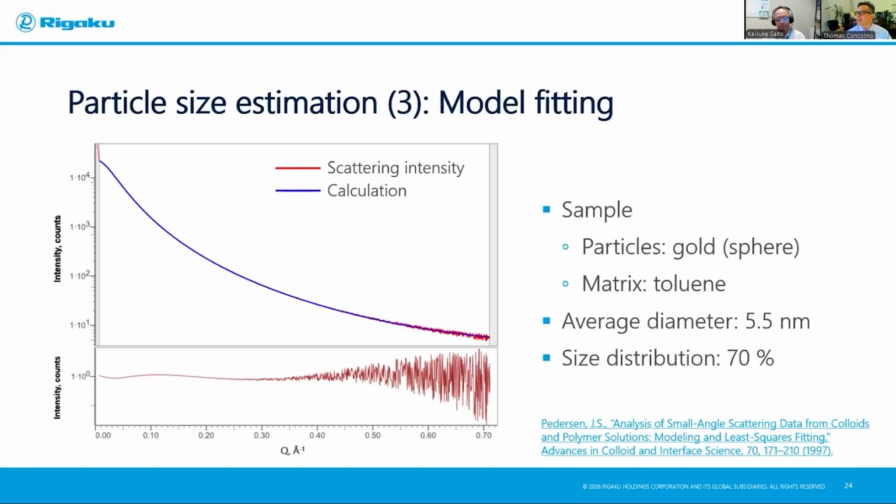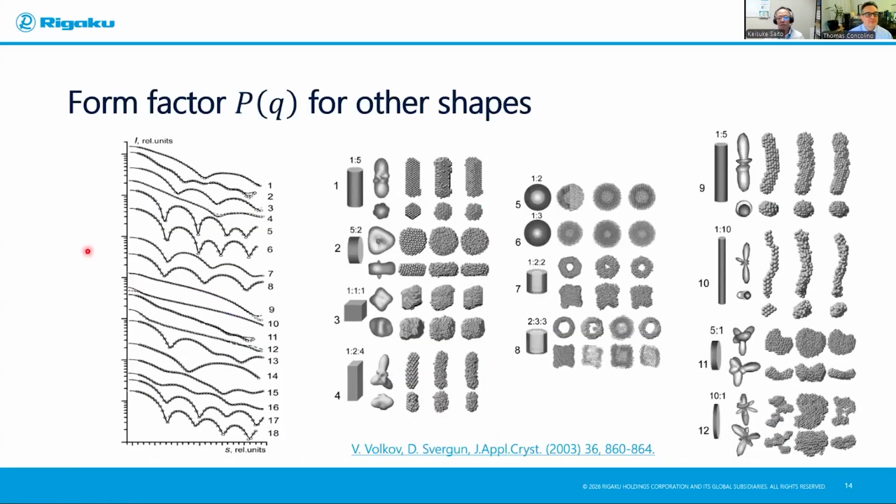Okay. And then the other part of that question was, can you model the voids instead of the particles? Yeah, as we discussed, let me go back to the form factors. Different shapes and forms have different form factors. And as long as your software supports your structure, your form factor, you may be able to analyze it. For example, our software from Rigaku supports rod, disk, core-shell particle, and random fractal, like a gas or liquid. So those four are supported.